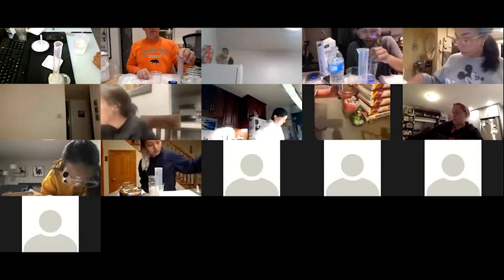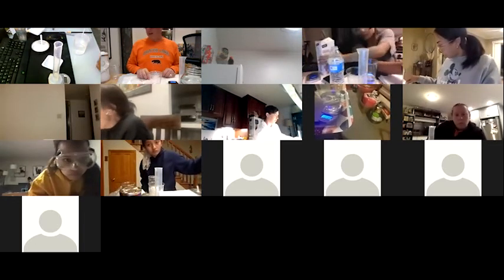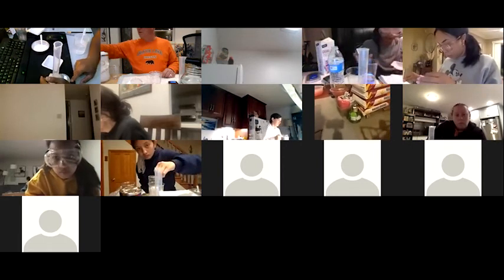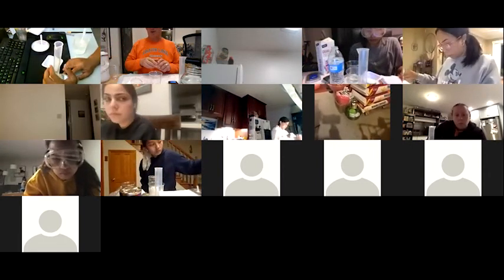Okay, because it just says OL on the machine. That means it's too heavy. Yeah, turn it off and on again. These cups are even less, so you've got to have more than 50 grams in there.